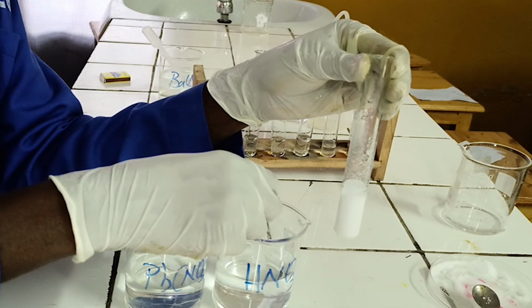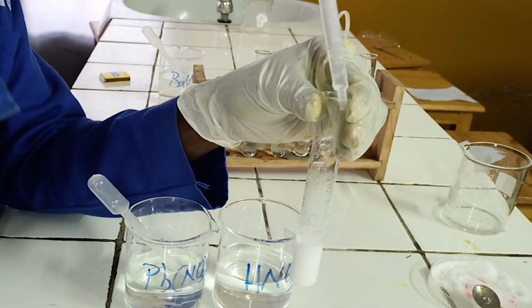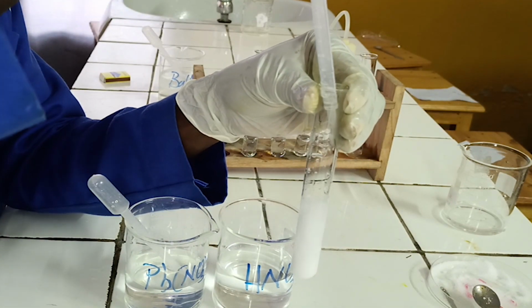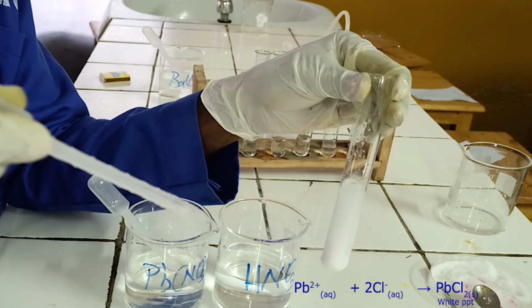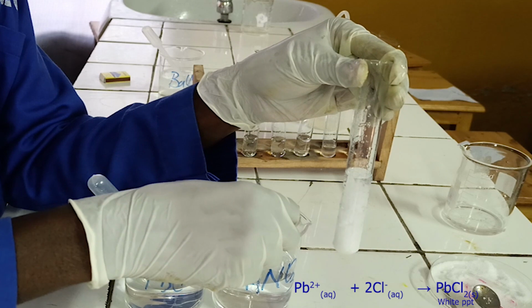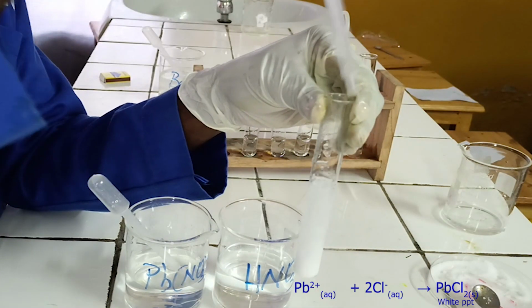As you see, lead nitrate reacts with chloride ion to form white precipitate. The precipitate formed is insoluble in diluted nitric acid. Below, there is the ionic equation for this reaction.